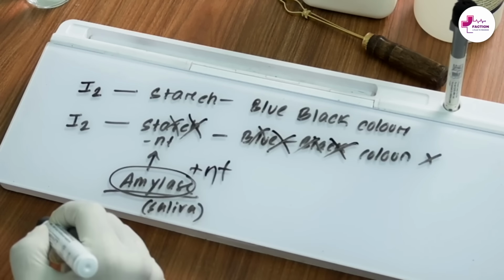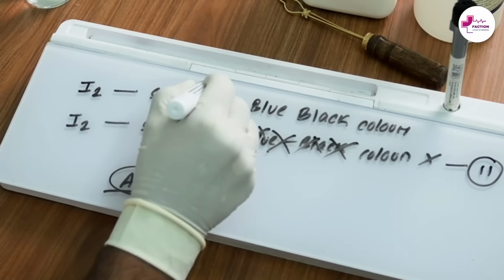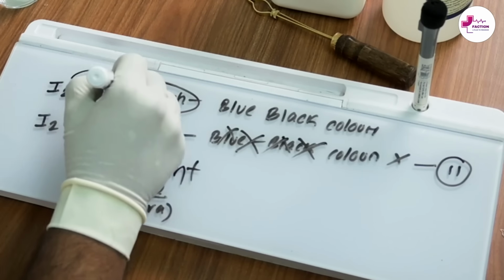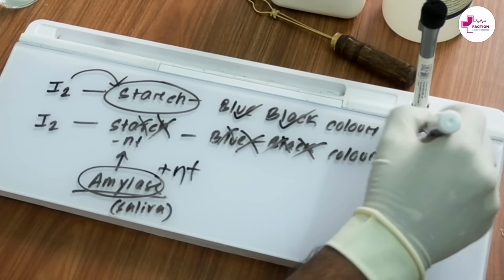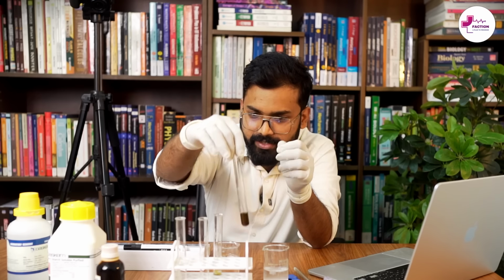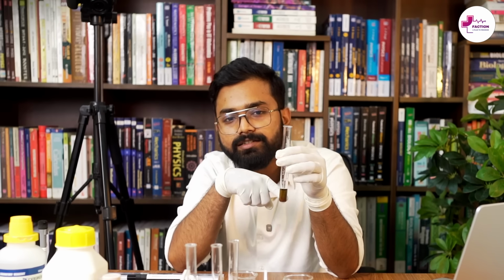This was our second test tube. In our first test tube, starch was intact. We gave iodine, so it should remain blue black. This is our first part. So our test tubes, if we see, this is our test tube 1. In this test tube, starch was present and it should have been blue black color. It is blue black color.